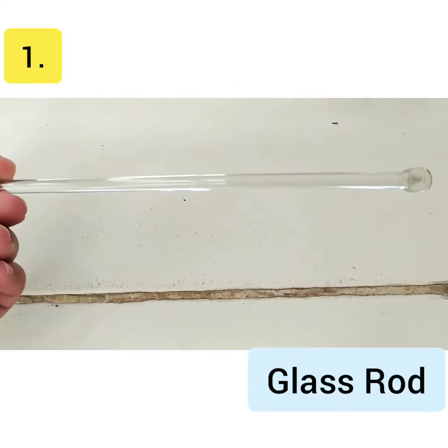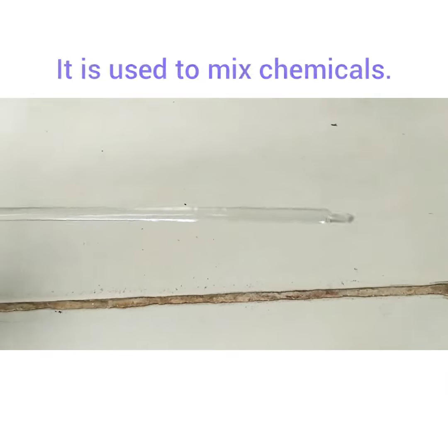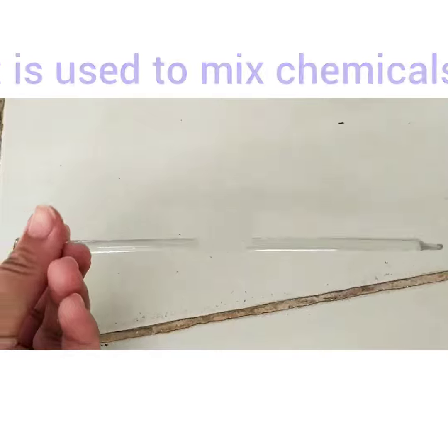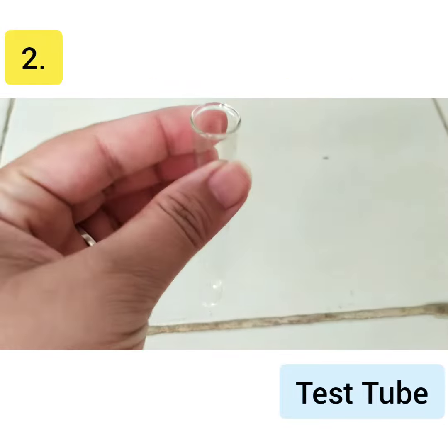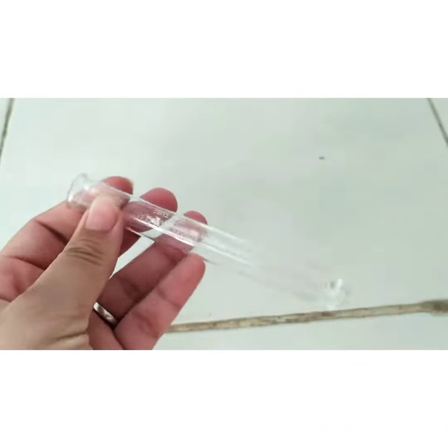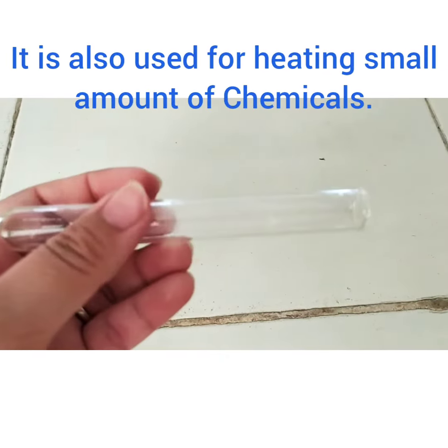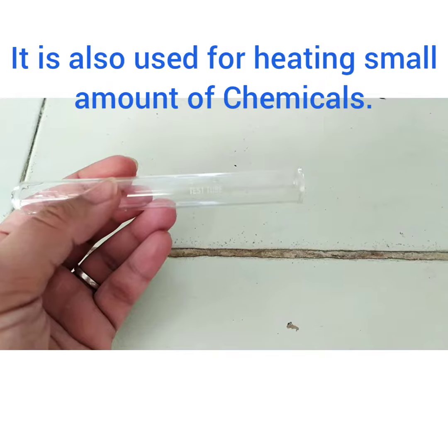Number 1. Glass rod. It is used to mix chemicals. Number 2. Test tube. It is used to handle chemicals. It is also used for heating small amount of chemicals.